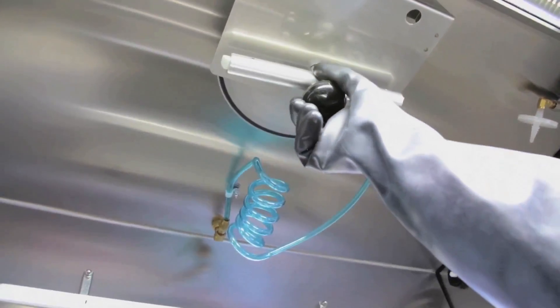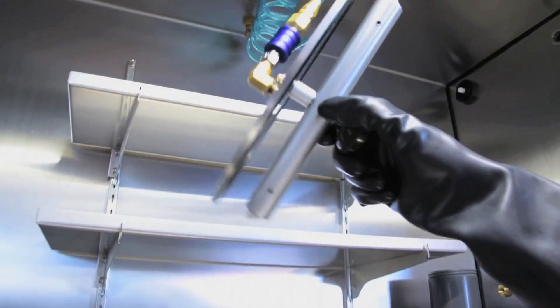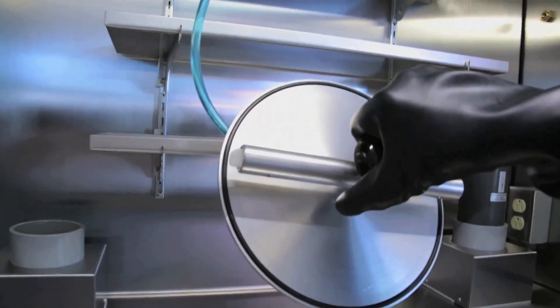The system is also supplied with an evacuatable internal glove port cover, which allows glove changes without compromising the purity of the glove box atmosphere.